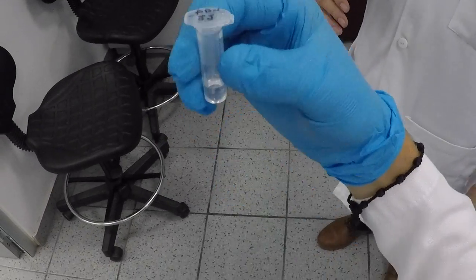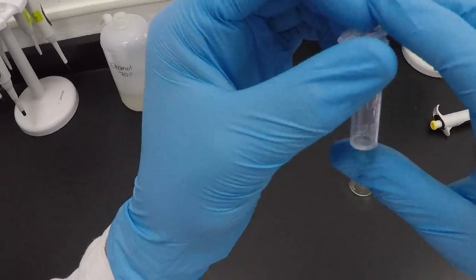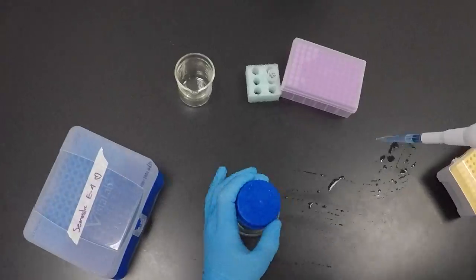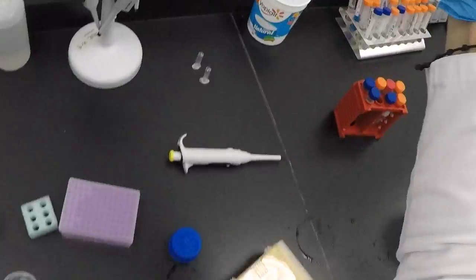Pipette off the supernatant and add 100 microliters of TE buffer plus 10 microliters of 3 molar sodium acetate plus 3 volumes of absolute ethanol. Centrifuge for 3 minutes at 8700 rpm.